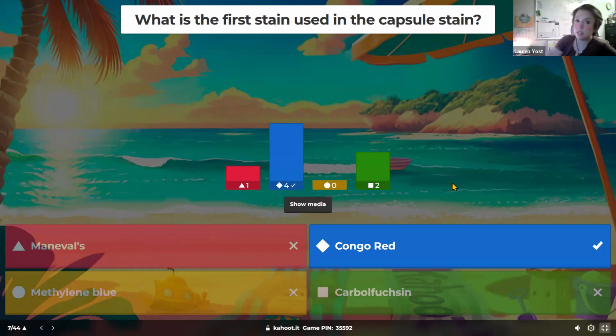Yes, study the other details too, but this is what I'm saying. The different stain types that we have, the different differential stains that we did. Just the differential stains: gram stain, acid fast stain, capsule stain, endospore stain. What other differential stains did we do? That's it. I get a lot of students during the lab midterm who say it's a lot of colors and a lot of stuff to know. It's four differential stains. If you can remember gram stain, positive is purple, negative is red.